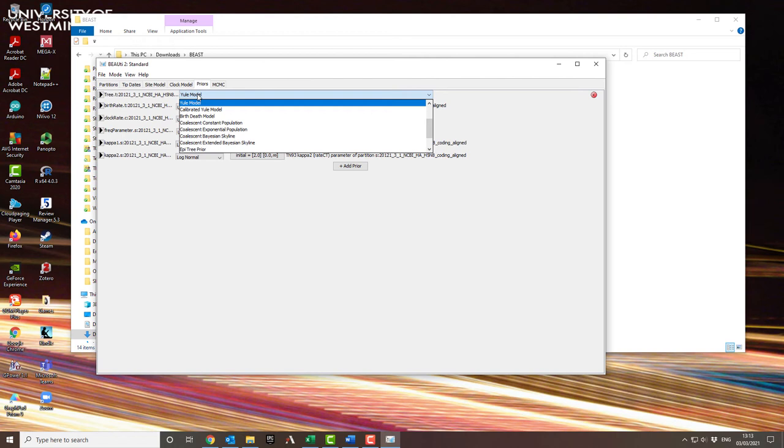So the coalescent model comes in different forms. You probably won't have a choice of these four. I've got them because I've got more modules enabled than you will have. You'll probably just have constant population and exponential population.